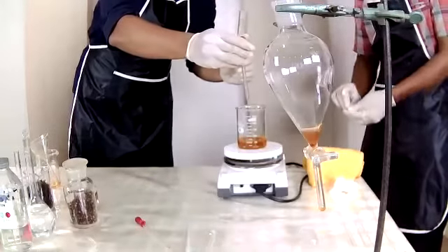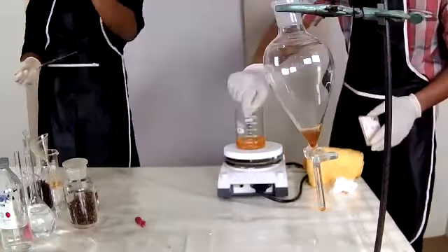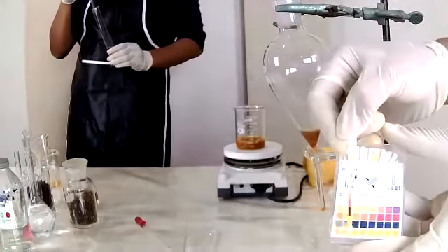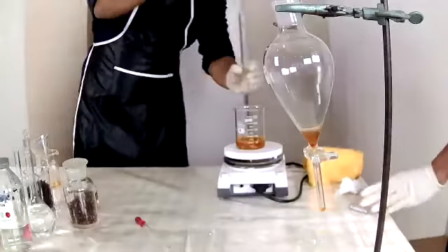We can check the pH now. It's still quite high. We can add more HCl.